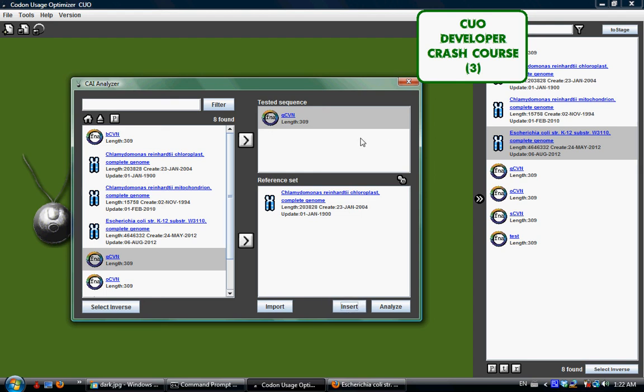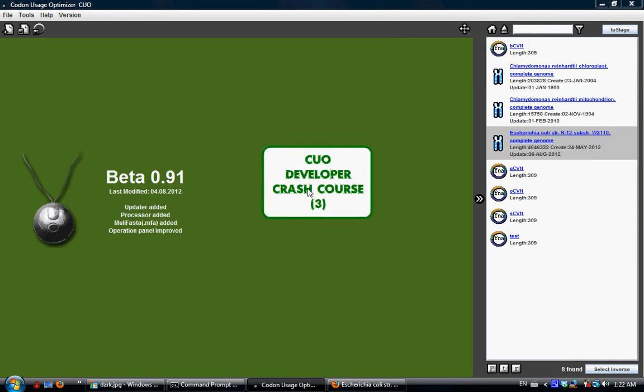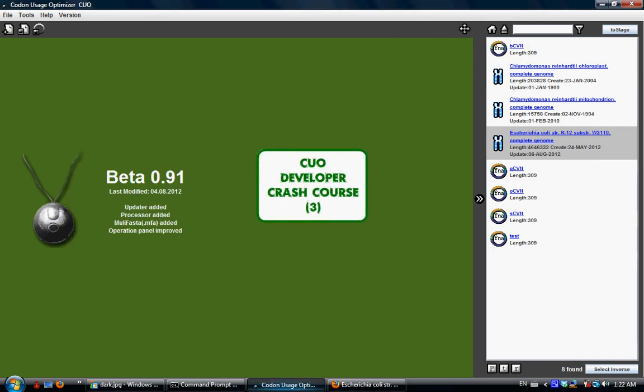And okay, that's all for the CAI Analyzer. Crash Course 3 done.